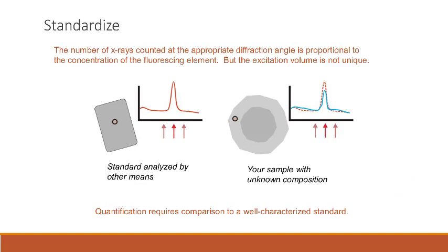Much like X-ray fluorescence, EPMA relies on wavelength dispersive spectrometry to produce accurate analyses. That means we're after the peaks in their locations for characteristic radiation from an element within our sample. We're characterizing the background that surrounds that, and we're comparing it to a known standard on a frequent basis. The known standards have to be characterized through other means or by multiple analyses so that they are useful for speaking to the elemental composition of our unknown material.